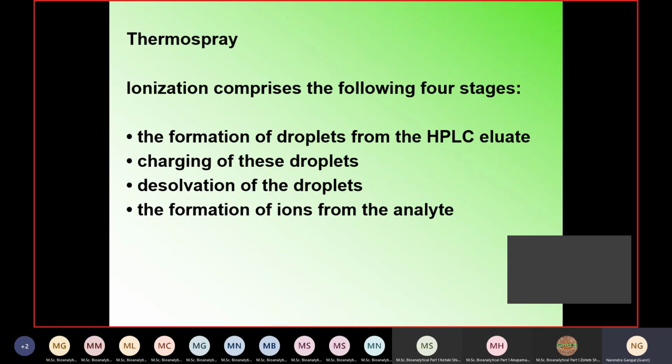So that is basically the purpose of the buffers. Now one of the important things you must remember with the buffers is that they have to be preferably evaporable in nature. That is why the organic based are typically used. You can use sodium acetate also, you can use ammonium acetate also. That is why ammonium acetate is a preferred buffer or salt as compared to sodium acetate. All those things will come more and more.